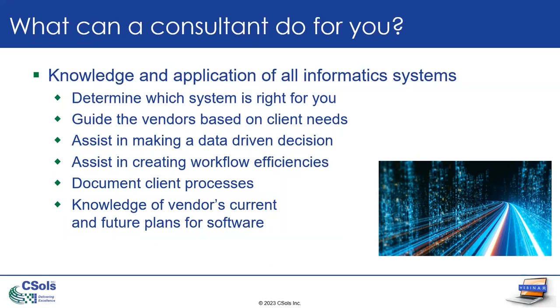The guide for this will be based upon the client's needs. So whatever needs you have in generation of your requirements will guide the vendors on what they need to show you in the solution. When they show you this solution, you score it and you can make a data-driven decision.